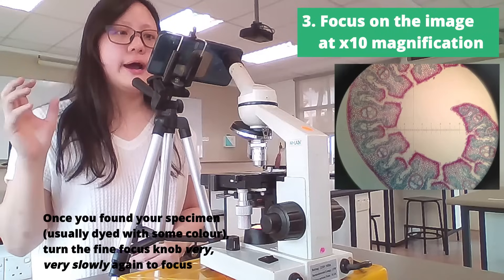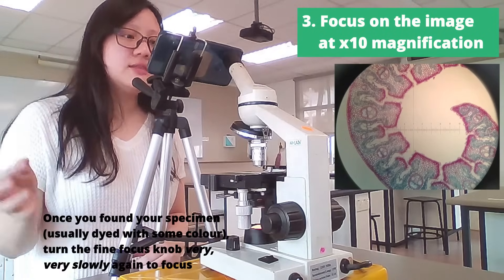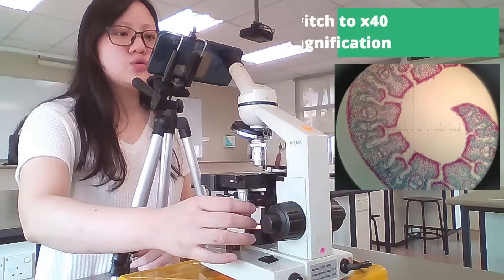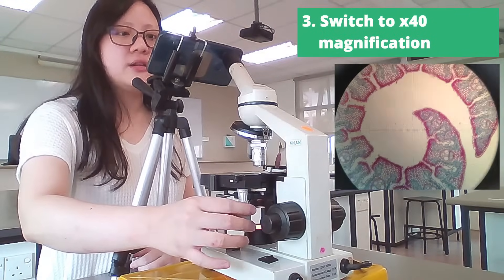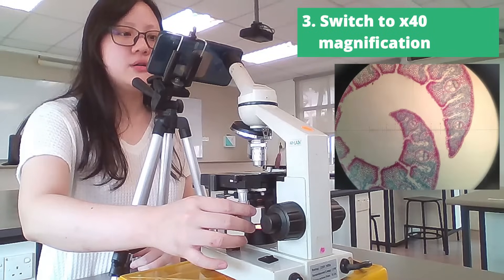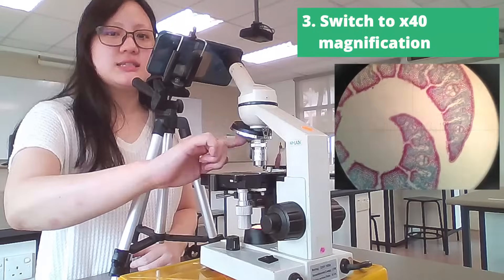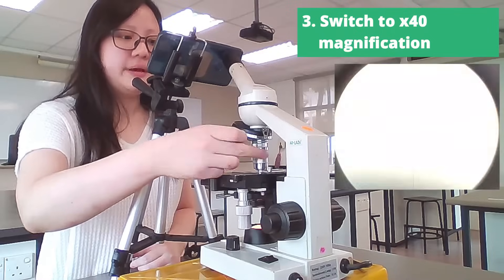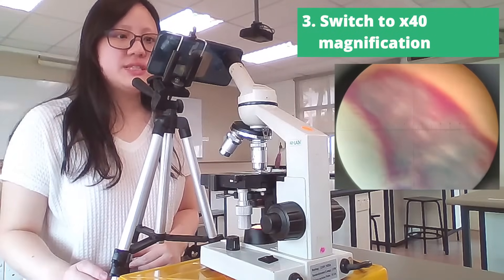After you focus on the specimen at 10 times, we are ready to look at it at 40 times. Make sure the part that you want to look at is in the middle of the slide. Then you rotate these lenses, switch it to 40 times, and make sure it clicks. You should see something like this.